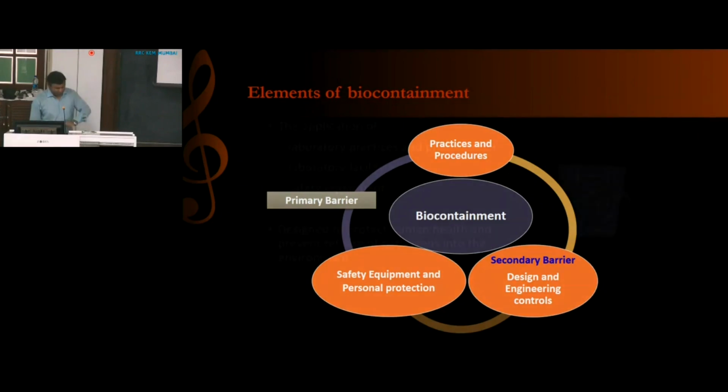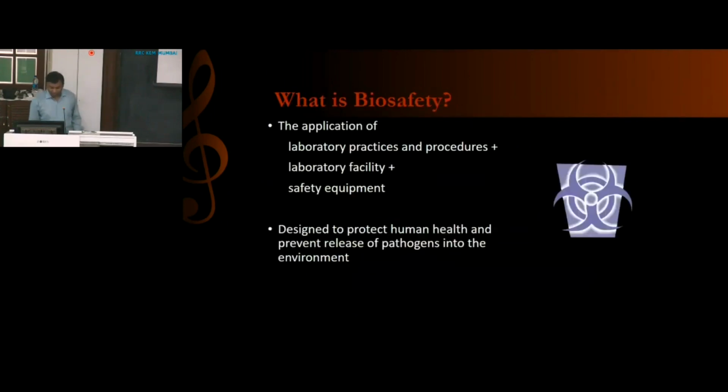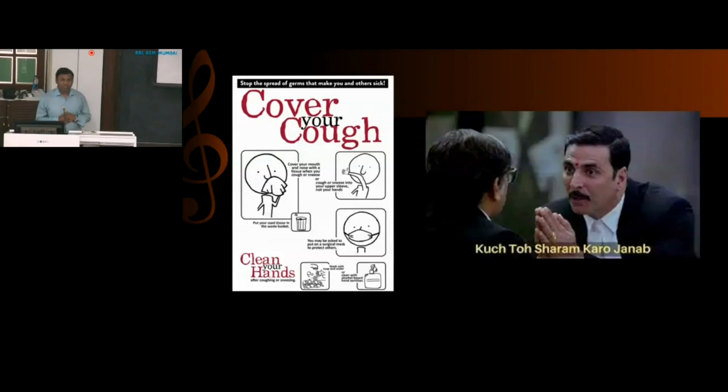What is biosafety? Application of practices and procedures. I have written lab because we generally teach this to the lab personnel, but this also applies to the healthcare institutes and doctors. Designed to protect human health and prevent the release of pathogens into the environment. Respiratory etiquette, non-existing in India practically.